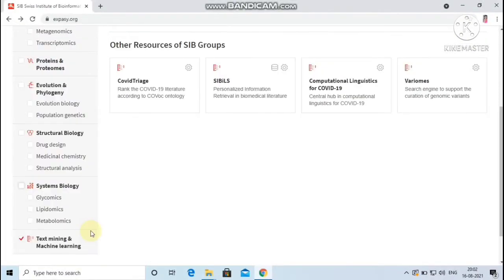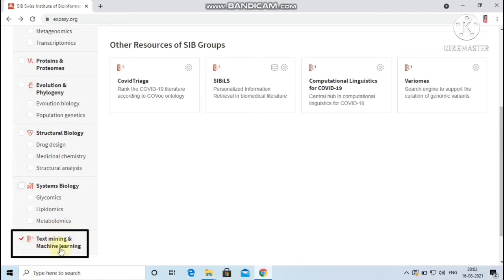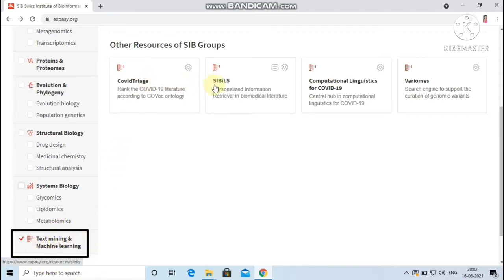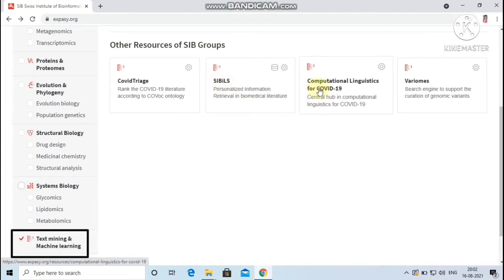And finally, there are only four resources available under the category text mining and machine learning. They are COVID Triage, SIBiLS, Computational Linguistics for COVID-19, and Variomes.